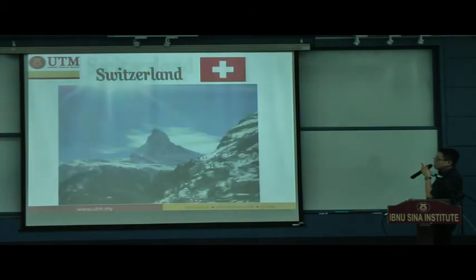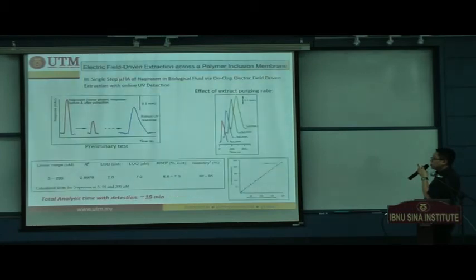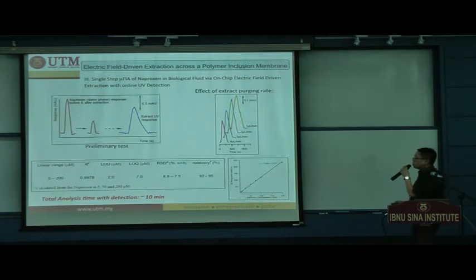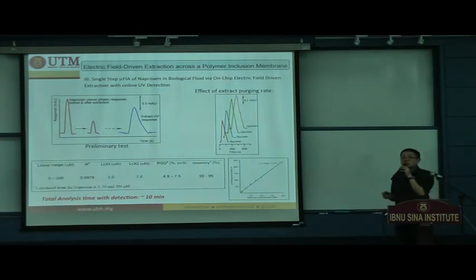The result is very promising because for most of the data we reported so far, we have an RSD, the relative standard deviation, which we determine from 3, sometimes 5 replicates of identical extractions. Normally we never exceed 10%, which is very good. Some of the experiments achieve below 5%, depending on your sample matrices.